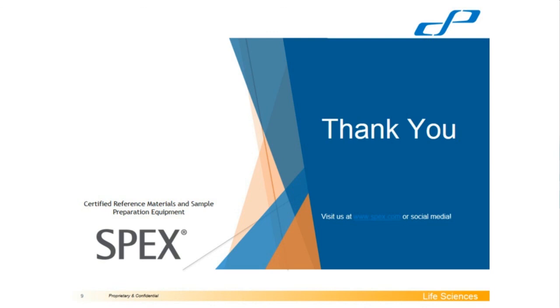Brilliant. I just love the detail you give in the answers here. The last question before we sign off: there are now solvents designated as LCMS solvents, not just HPLC solvents. Is there really a difference? Well, the whole designation between LCMS and HPLC is sort of a branding issue. There are some differences, and as Alan said in the presentation, you really want to read the manufacturer's description and specifications to know what they do to qualify that solvent. In general, if you're doing most LCMS experiments and you're looking at PPM levels, you're not going to really need an LCMS solvent because they can be also very pricey.